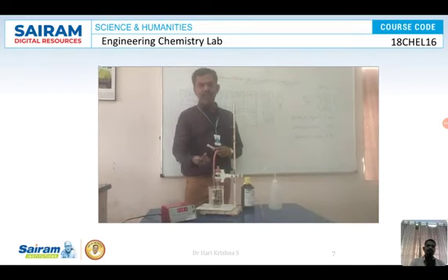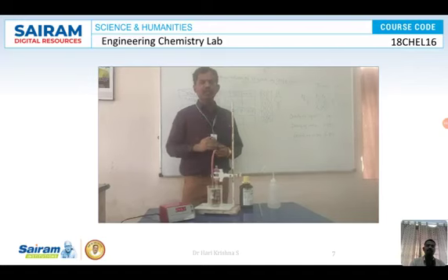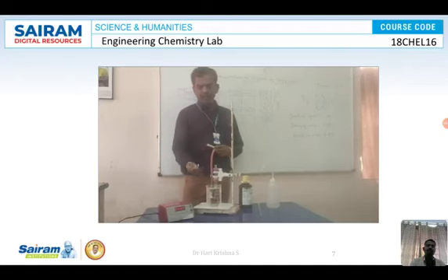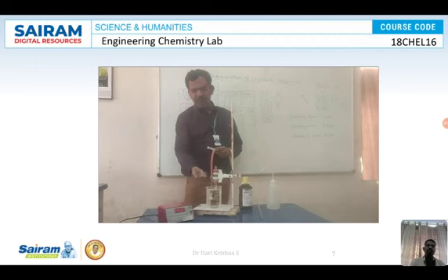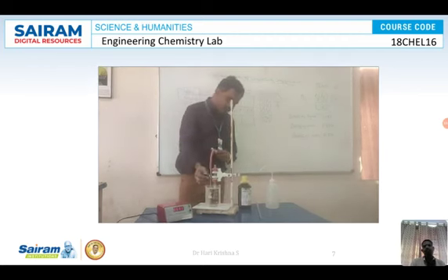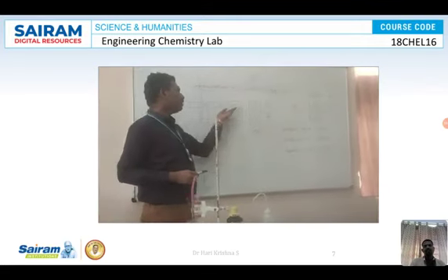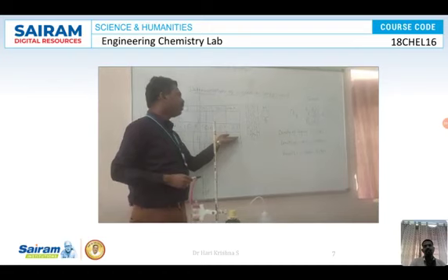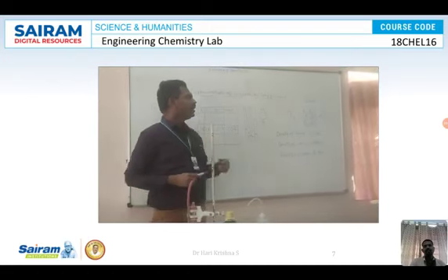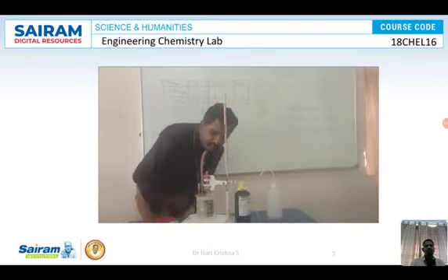We are also going to take a dry viscometer. If there is any organic solvent, what will happen? Two layers will be formed and the viscosity will vary. So always take care that the viscometer and solvent are dry. The dry viscometer is taken and we measure the flow time of the water from this point to this point. Once this is done, we calculate the mean time taken for the liquid, the mean time taken for the water, and calculate the viscosity coefficient of the given organic liquid at the given temperature.